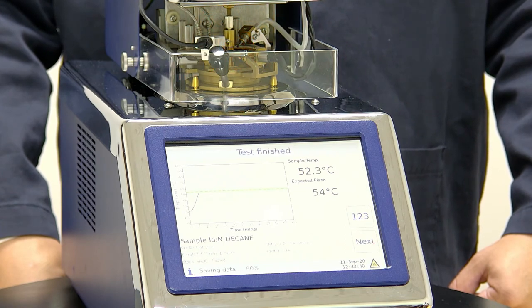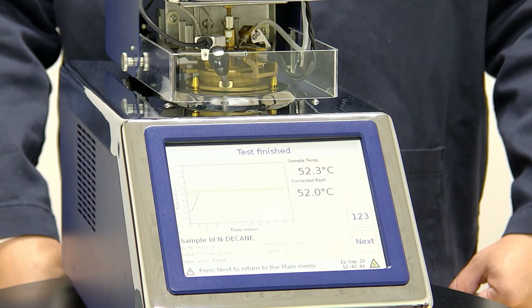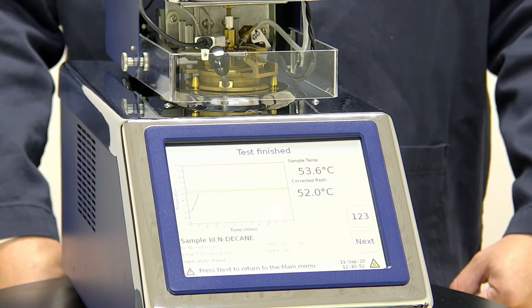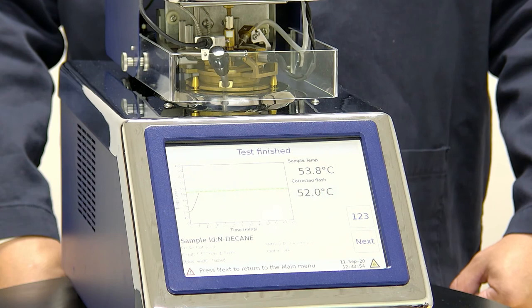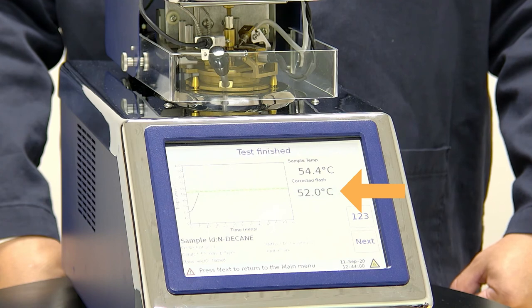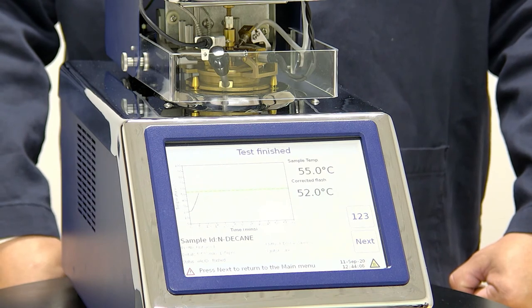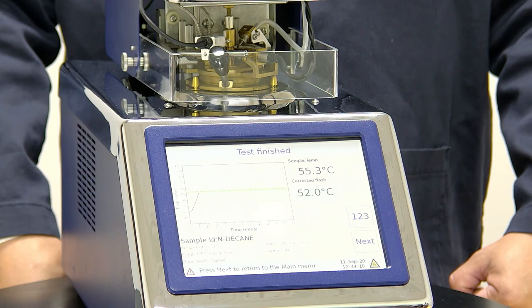We've hit our flashpoint and you'll hear the instrument. It makes a very distinctive sound which is selectable from one of six different sounds. We have our corrected flashpoint on the bottom along with our current sample temp. As you can see, our corrected flashpoint was 52.0 degrees which is within range of the procedure A for N-Decane which would be 53.8 plus or minus 2.6.